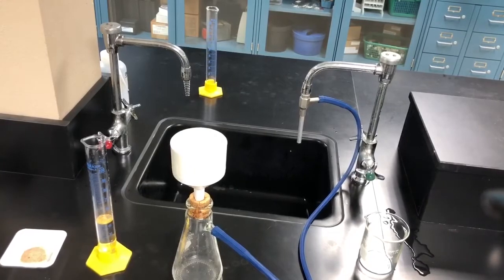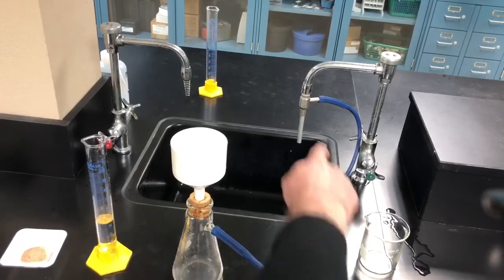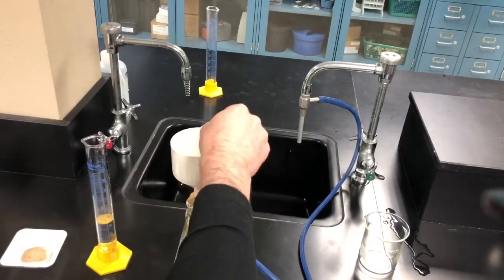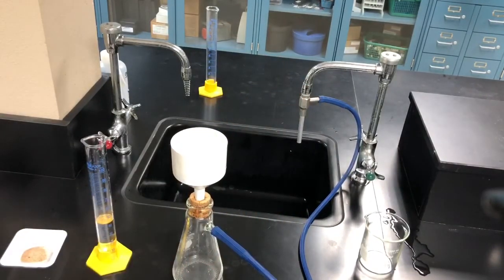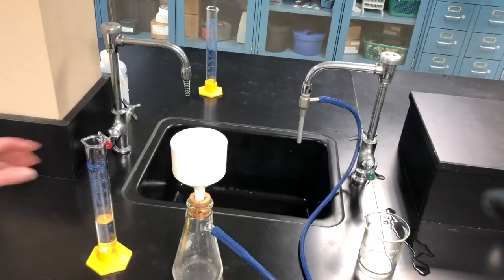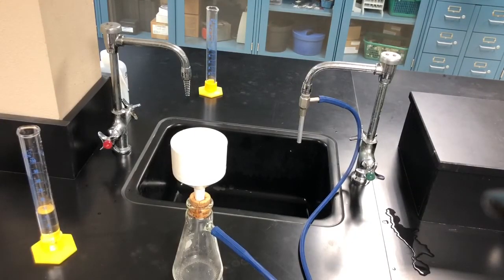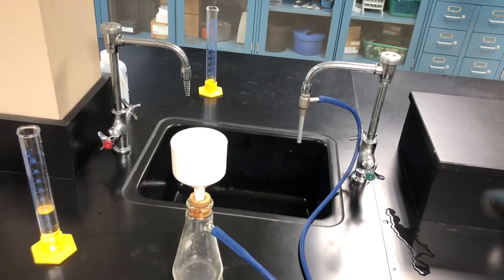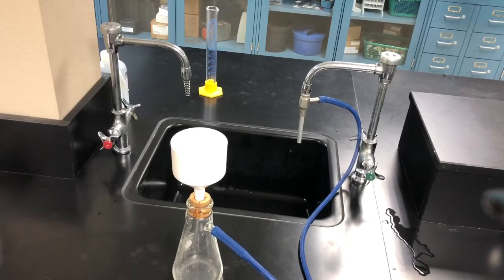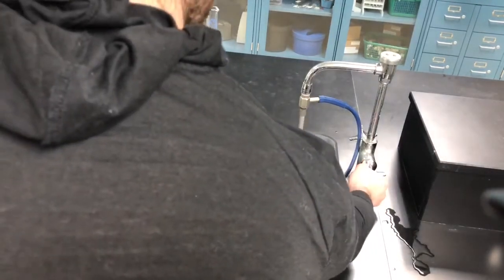This is the vacuum filtration procedure. We'll be using a Buckner funnel, an aspirator, and tubing hooked up to a water faucet that creates a vacuum and suction. Take a piece of filter paper specifically for vacuum filtration. We've weighed up 5 grams of sand and about 45 mL of water, and we're going to put them in a beaker.